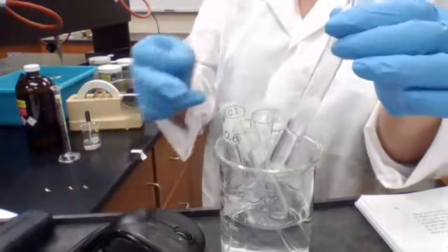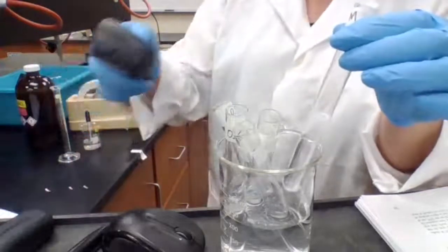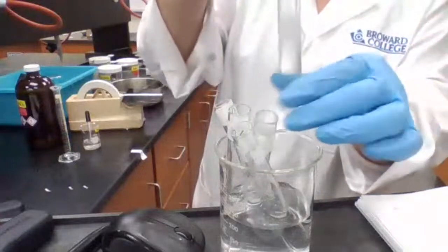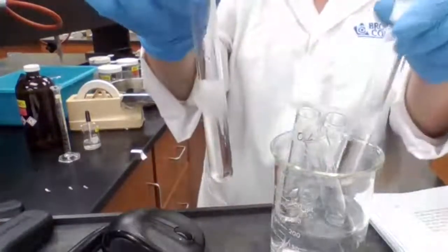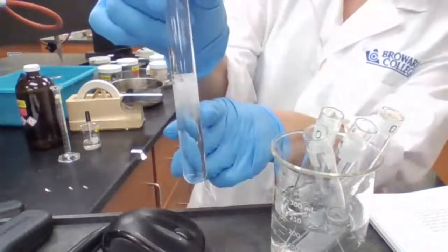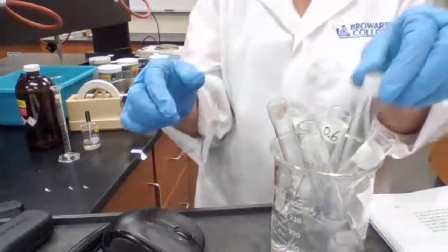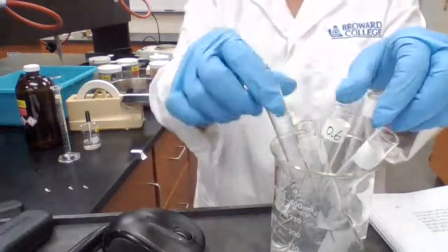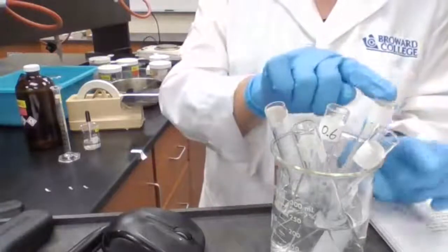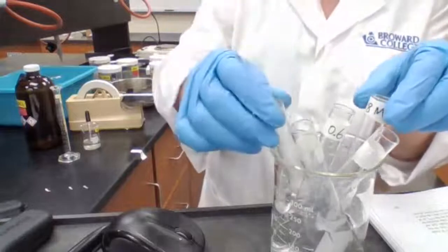I just found another timer, so to my test tube 2, I'm adding 1 more. It forms bubbles. This is a slower reaction. This one forms bubbles, but has not dissolved yet. Okay, so I'm going to place it in water and wait for it to dissolve. And it tells you how long it took for test tube 2, which is a 0.8, but you have to do the calculation to find the concentration.